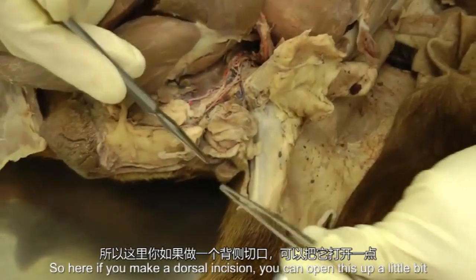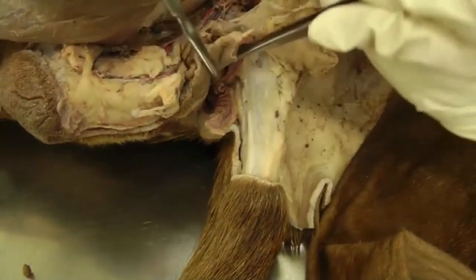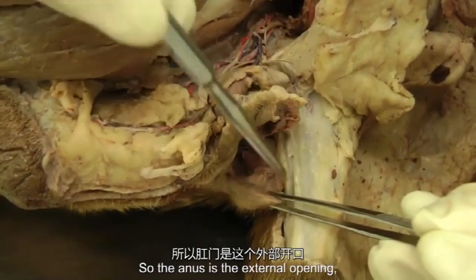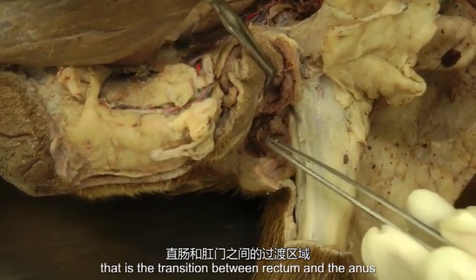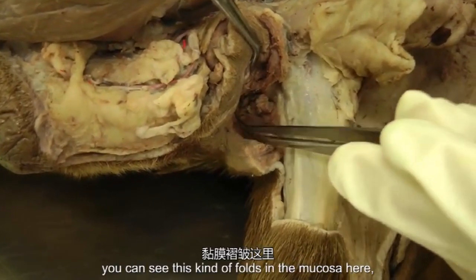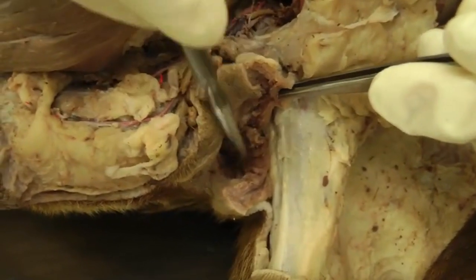So here, if you make a dorsal incision, you can open this up a little bit, and you'll see that anal canal. The anus is the external opening, and the anal canal is just this little area that is the transition between rectum and the anus. So here we have the columnar zone. You can see these folds in the mucosa here. So that's the columnar zone in there.